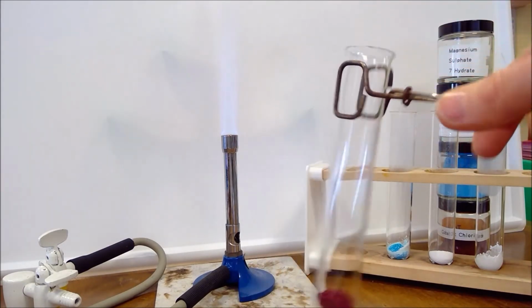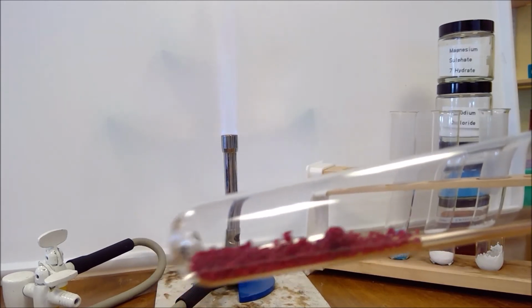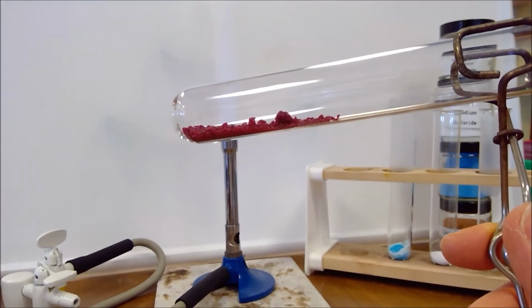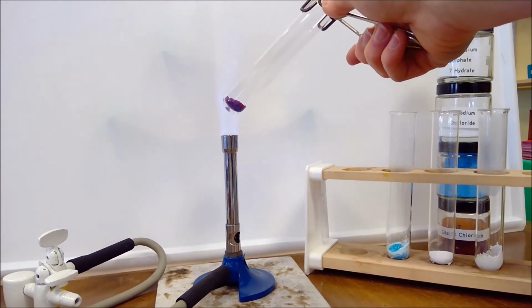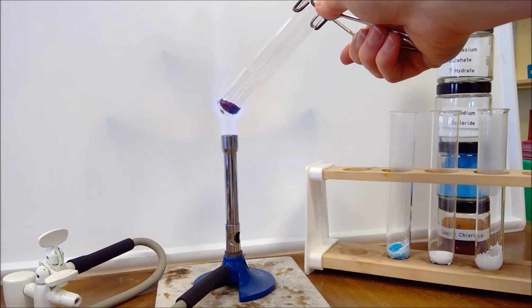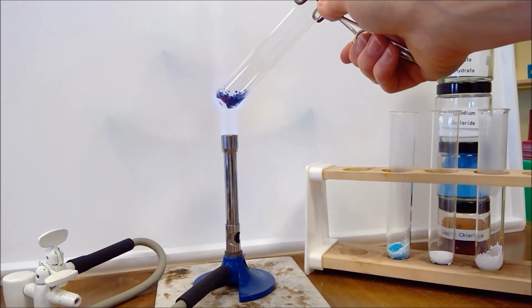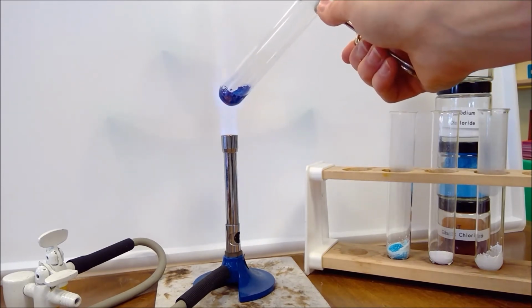And then finally, we have our cobalt chloride crystals here. So you can record the appearance at the beginning there. Coming out slightly more in focus. There we go. And then we'll heat these. Again, we can hear the fizzing there. I think so much water of crystallization is coming off.